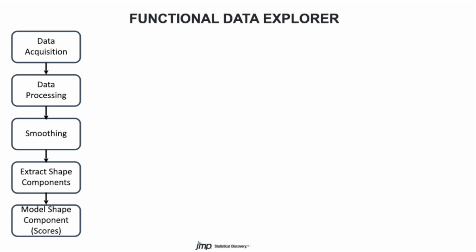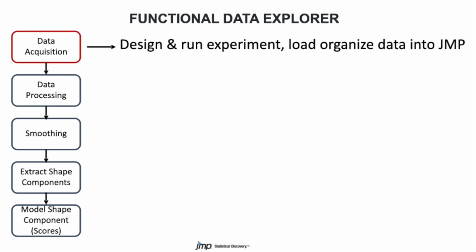This process has about five steps to it. There's a data acquisition step, which is where you're designing the experiment and executing it.